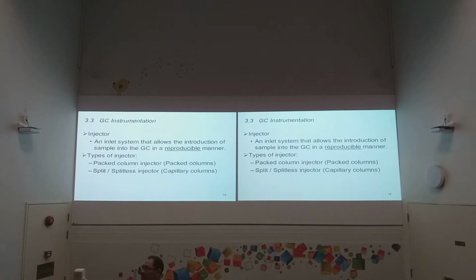We apply pressure and carry out the experiment. But nowadays all these are commercialized, and all the columns are fully developed in a very robust manner. In terms of industry application, they still have the so-called packed column. Later on, we'll revisit why there is still such a need and why we still have to keep the packed column. But in modern applications, most of the time we'll use another type of column, called the capillary column.